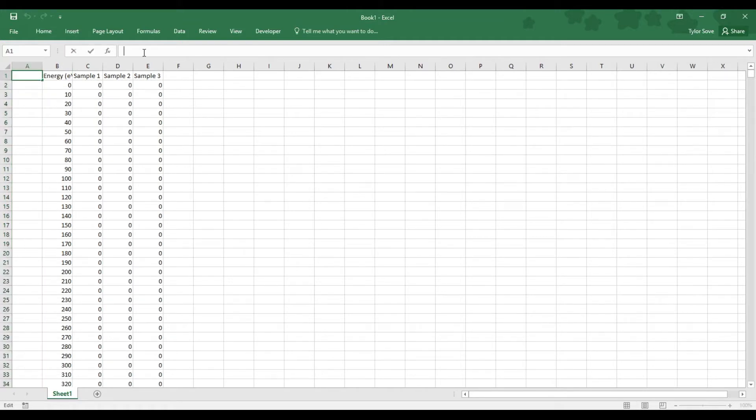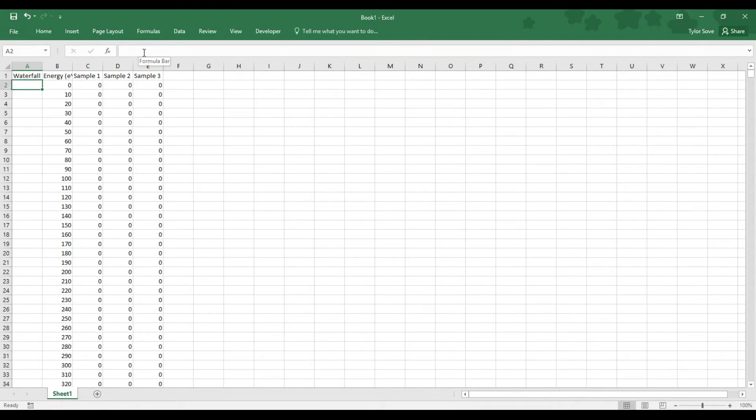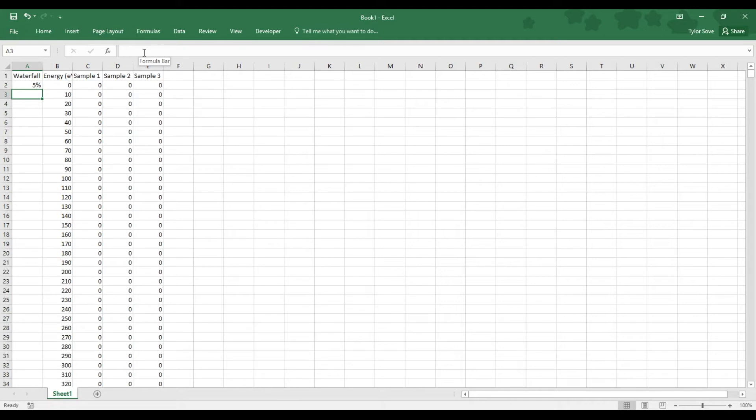Now in cell A1, type in waterfall offset. In cell A2, type in 5%. That number can be changed at a later time. 5% is just simply what I'm going with for now, as long as it has a percent at the end of it.